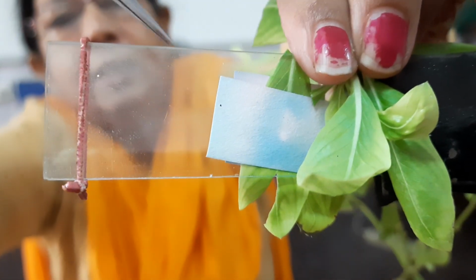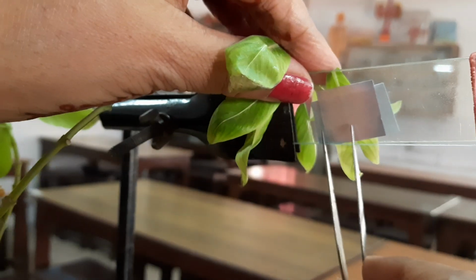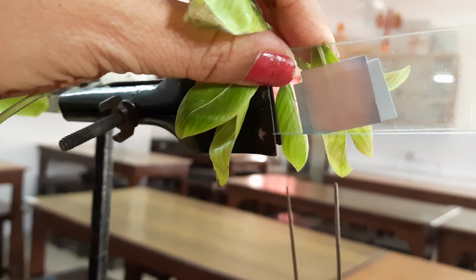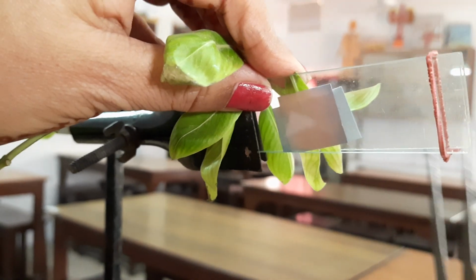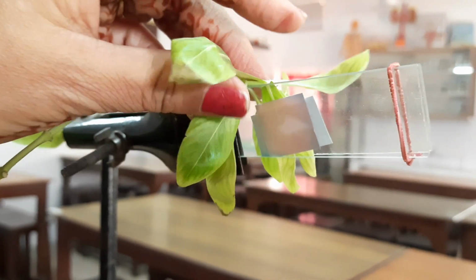Now you can see the paper has started turning pink, right? This is which surface? Upper surface, that is ventral surface. Now compare it with the lower surface paper, this one. You can see it has turned completely pink. At the same time both of the sides were covered with the paper, but on the lower side, that is the dorsal side, you can see the paper has turned pink faster and completely, right? While on the upper surface, that is the ventral surface, the pink color is less.